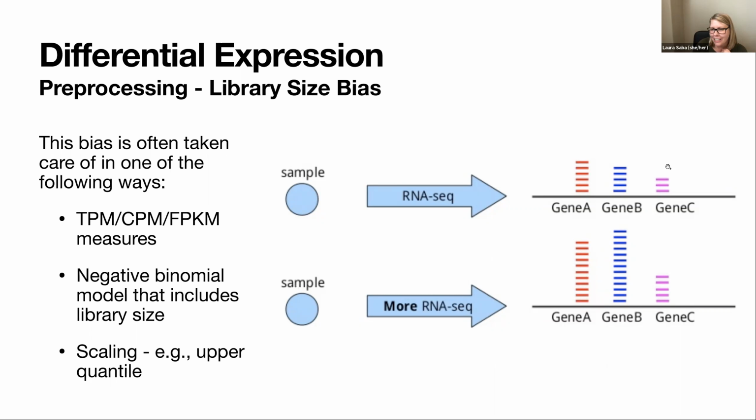In reality, it just had more reads. So RNA sequencing, just like microRNA or microarrays, is more of a relative abundance question than an absolute abundance question of these genes. So we not only have to talk about the read count for a gene, but how many reads we got for that entire sample.